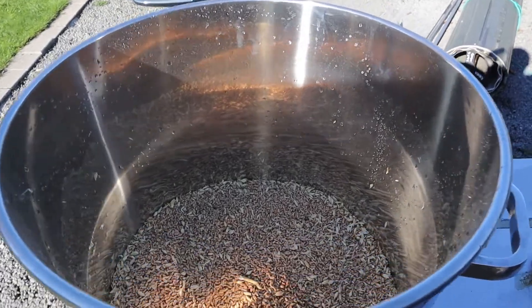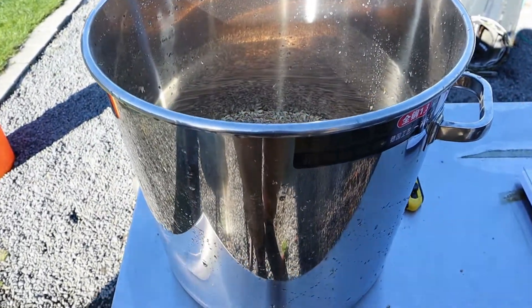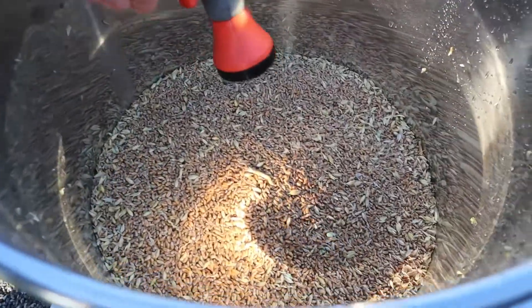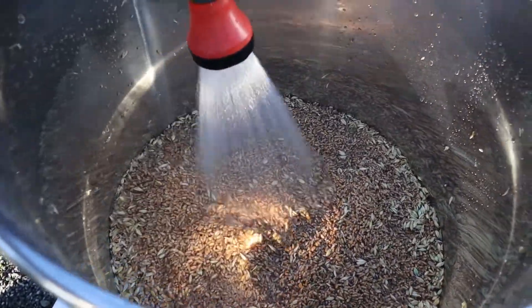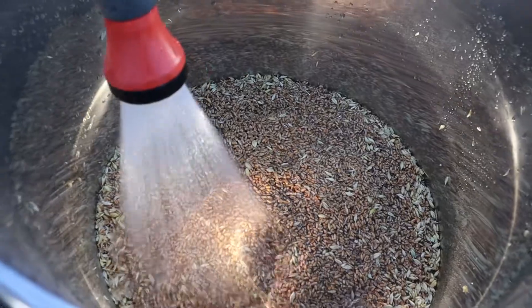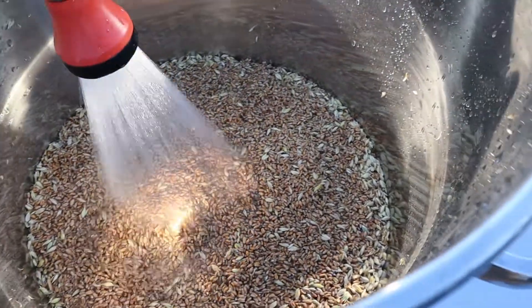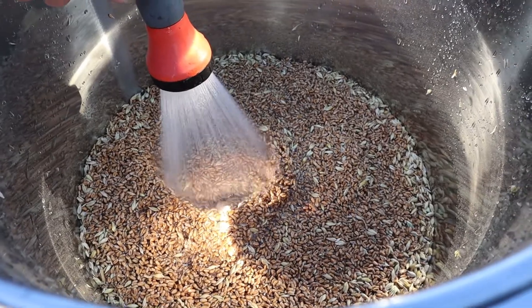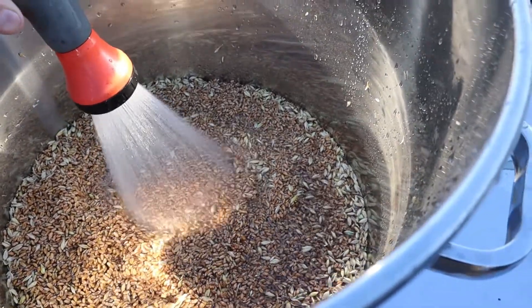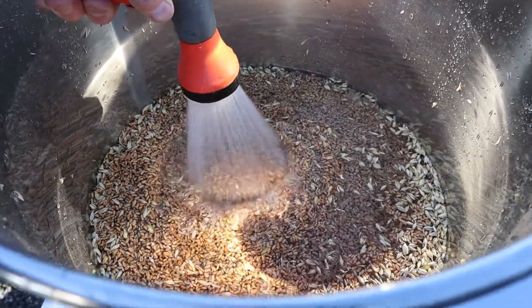Step two: now that we have just over 8 kg of dry grain in our stainless steel pot, I'm going to use the hose and give it a good clean. I'll fill this up about halfway, five to eight times, and really get all that dust and debris off the grain. I'll do this until the water runs pretty clear. As I fill this up and shake the grain around, you'll see a lot of foreign debris float to the surface.